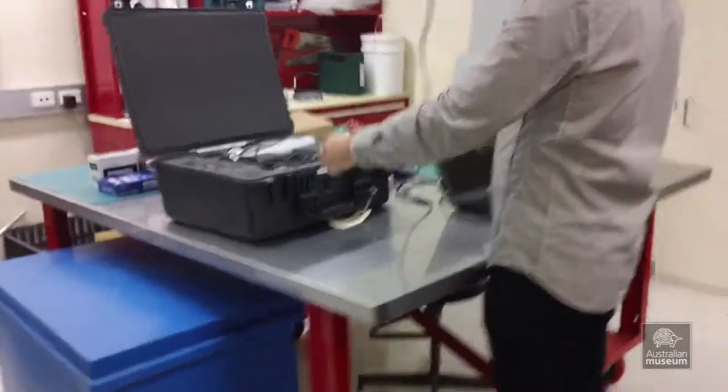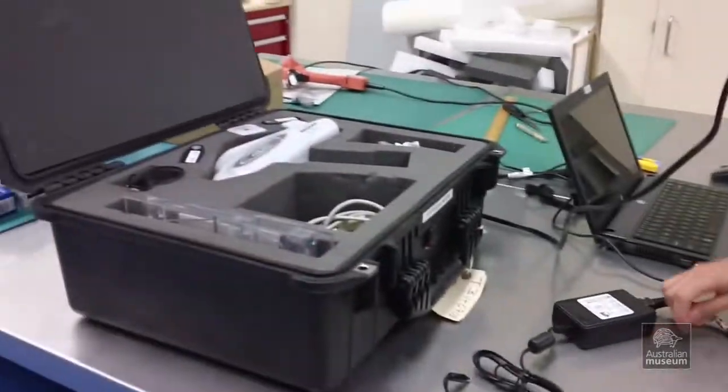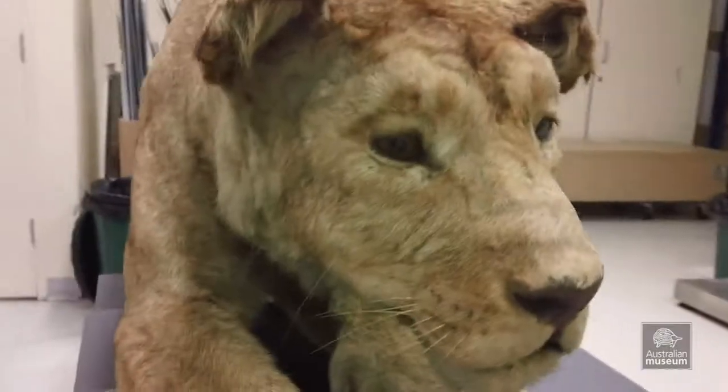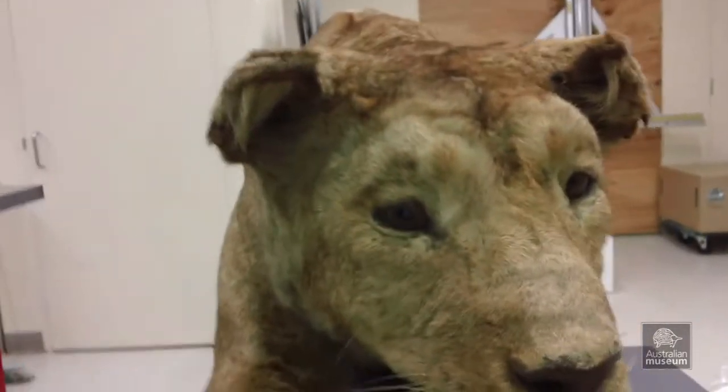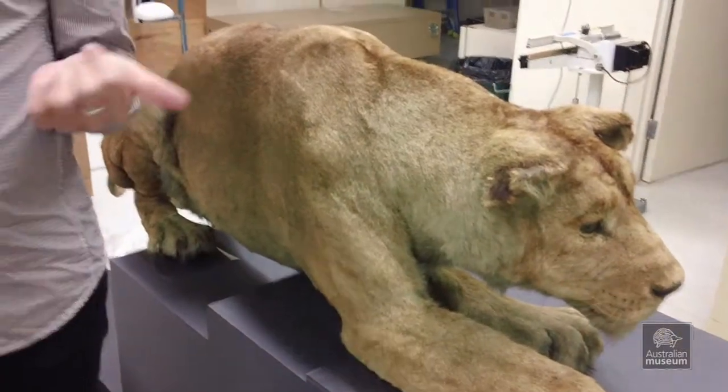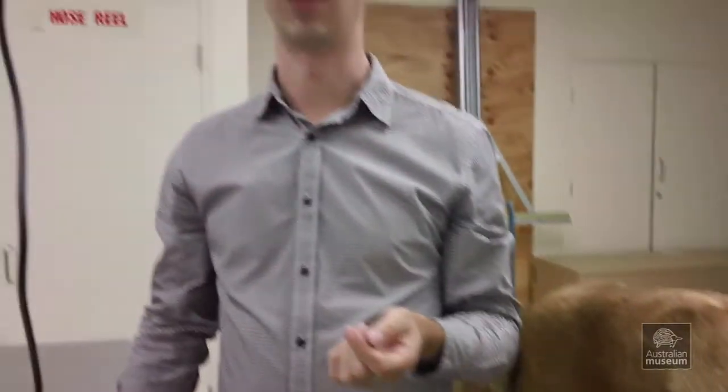It will analyse and detect elemental compositions — anything on the periodic table, it will pick up in trace amounts. We find it really handy because a lot of the poisons in the collection are heavy metals, so you've got arsenic, mercury, things like that.